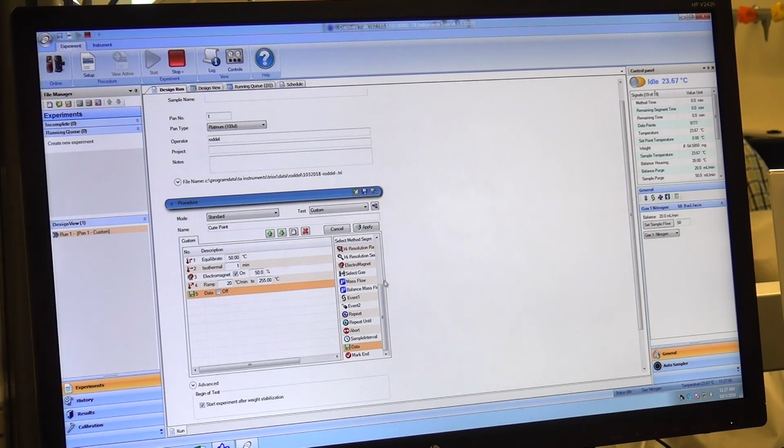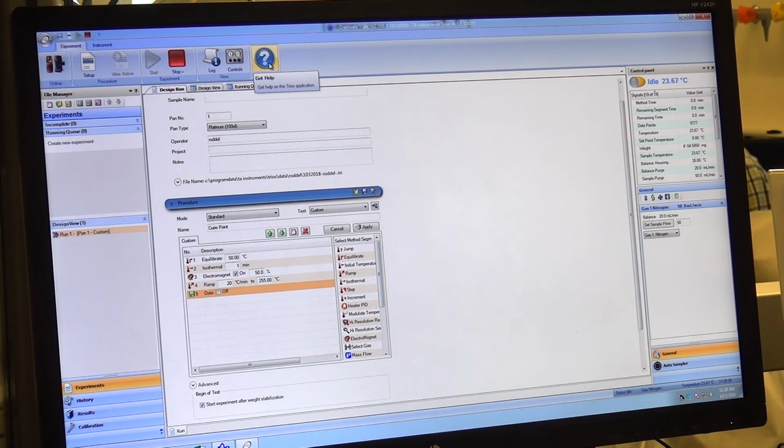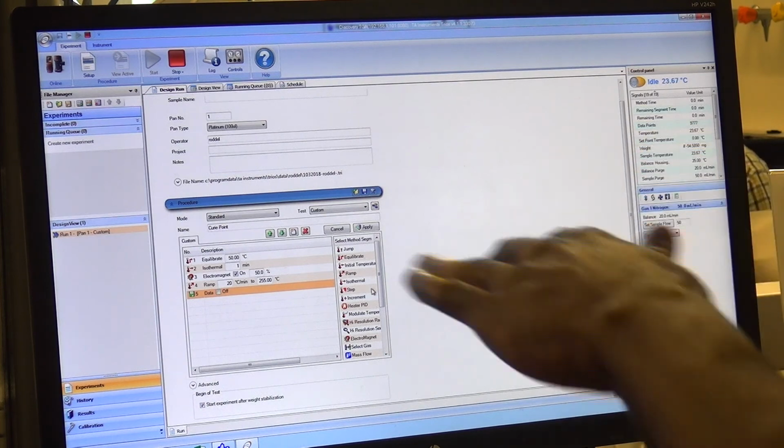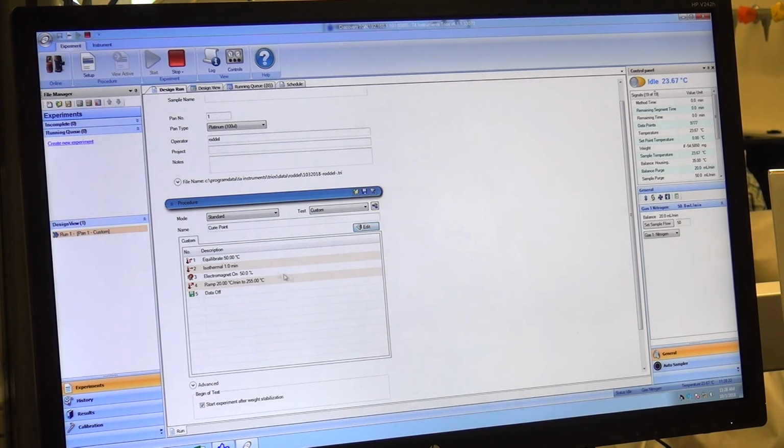All right. So these are, again, feel free to sort of look through all of the commands that you can use and what they are useful for. TRIOS has a very substantial help menu, so you can literally look up each one of those things, and it will give you a nice description of what they are and how you can use them. Okay. So once you are happy with whatever your experimental procedure is up here, you simply hit apply, and it would save everything as is.